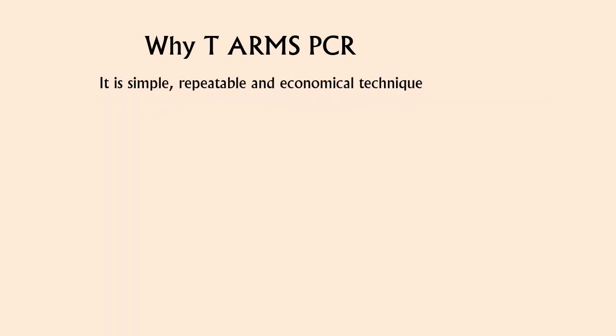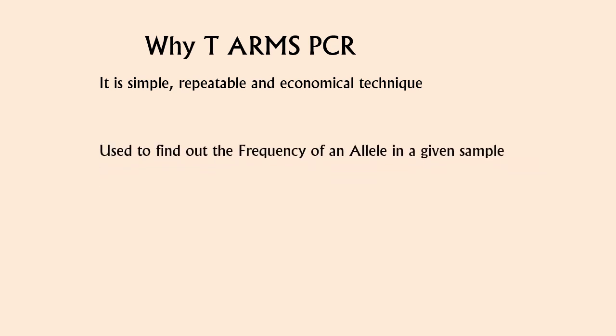We carry it out because it is simple, repeatable, and economical. It is used to find out the frequency of an allele in a given population.